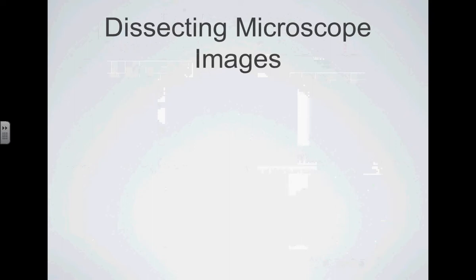The other important difference about the dissecting microscope are the two eyepieces. Two eyepieces allow you to get a good sense of the depth of the object. Do you know what depth perception is? Have you heard the term at least? Yeah, it's sensing how near or how far something is. Humans have very good depth perception. Do you know why?